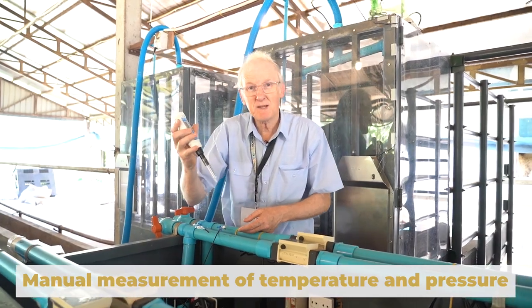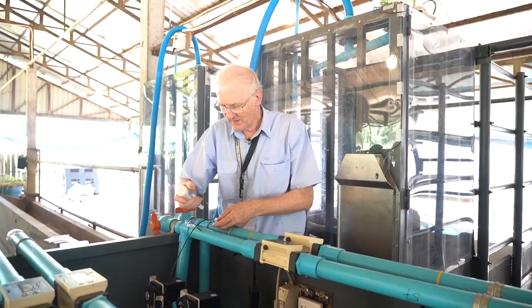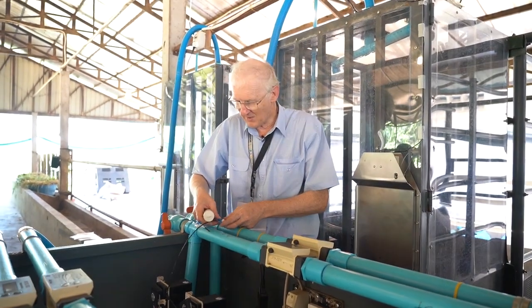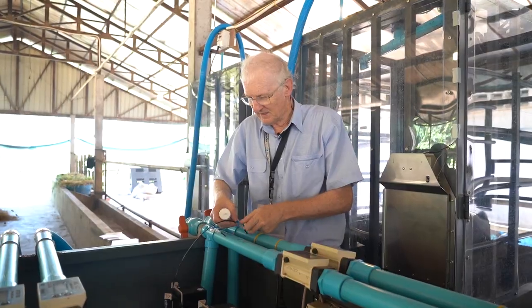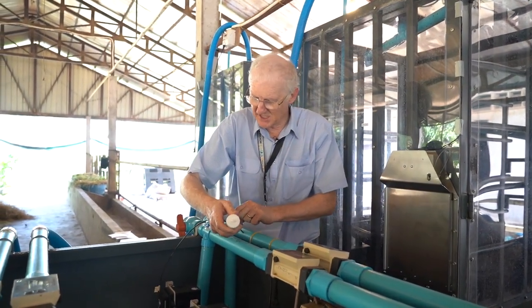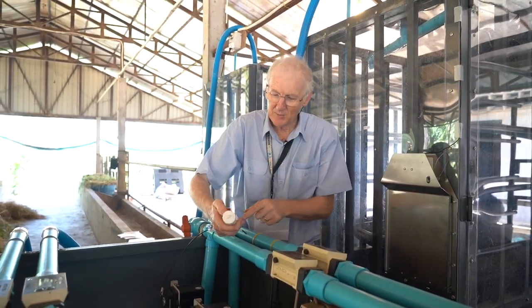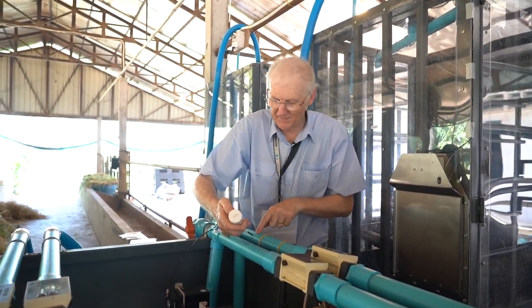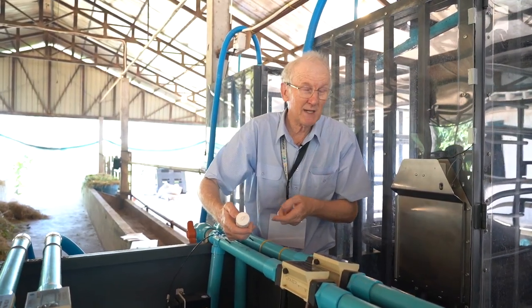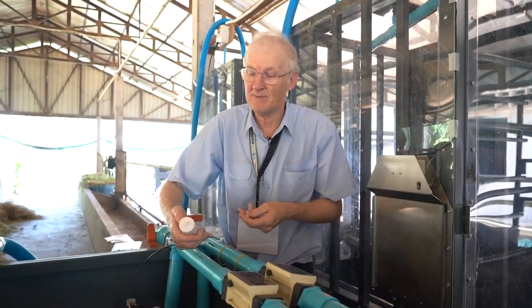So we have a very simple temperature and pressure gauge, and we can do it many ways here, but we will put our temperature and pressure gauge onto the pathway here, and it will tell us the temperature and pressure of the air inside the flow system. Normally it will be about 100 kilopascals, 1 bar.